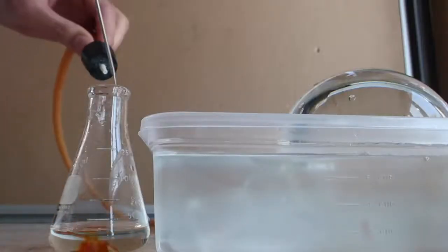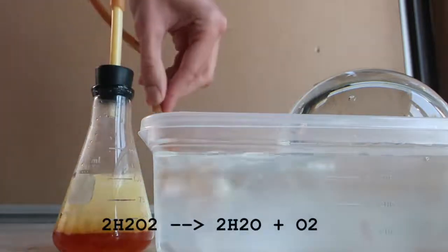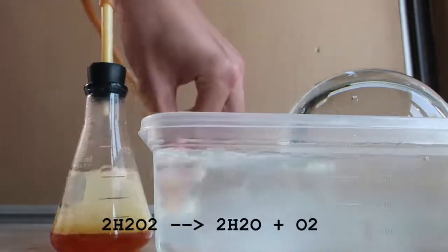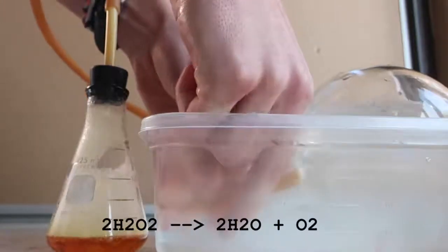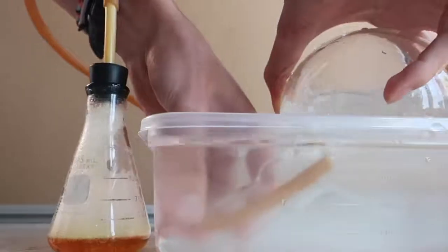For the first part of this reaction, we need to make oxygen gas. To do this, I added potassium iodide to concentrated hydrogen peroxide, creating oxygen, which bubbles through the tube and into the water-filled flask. The oxygen displaces the water, filling it with pure oxygen.